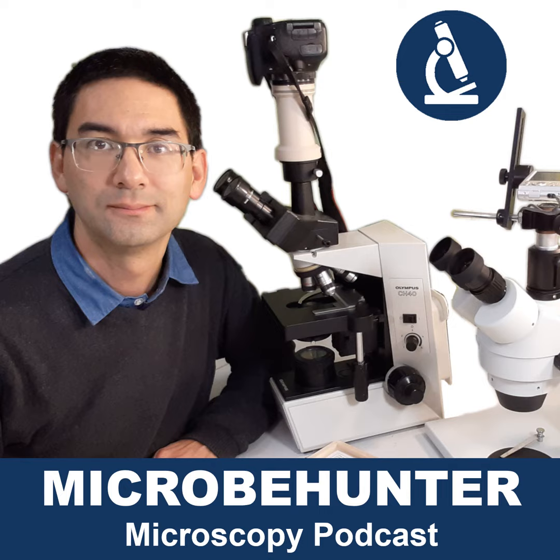Because many microscope cameras do not have this full dynamic range of brightness yet. They're not able to capture that. And so that means you're kind of losing some details. In most cases, it probably doesn't make a difference, okay? But there are certain cases with some difficult specimens where this can indeed be a problem.